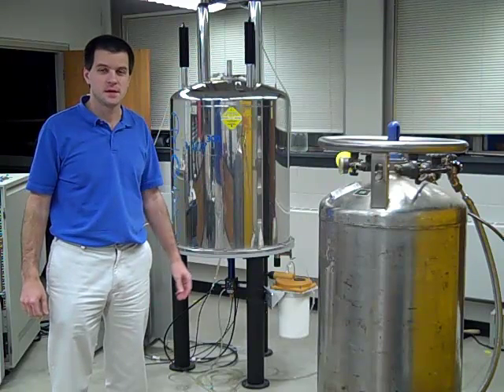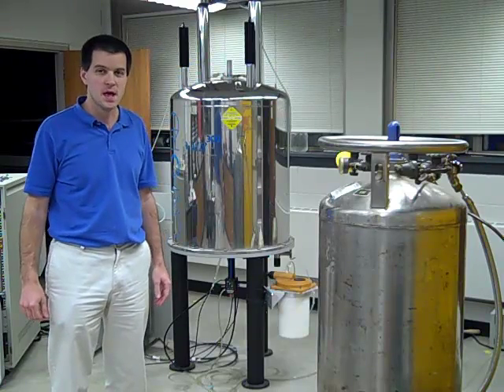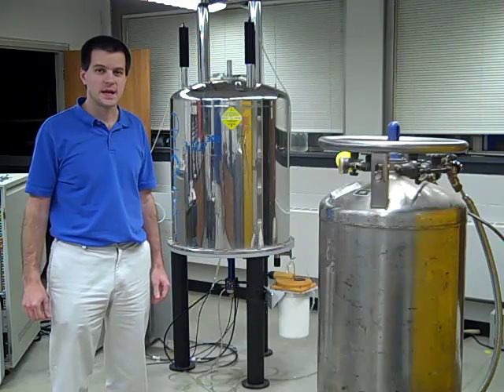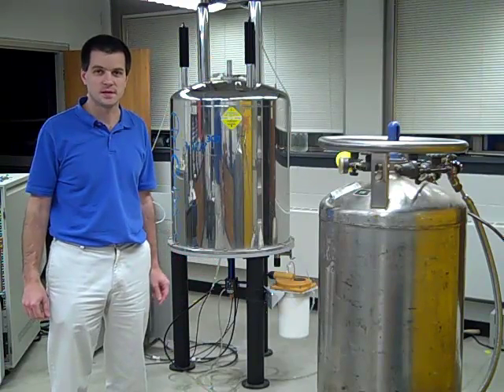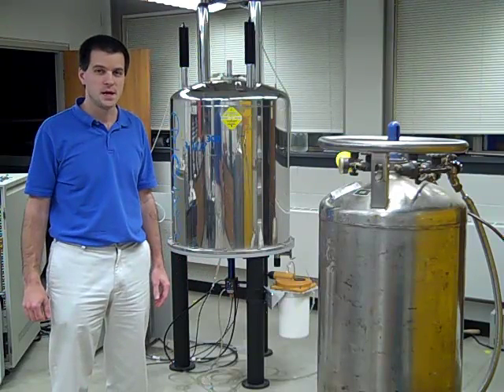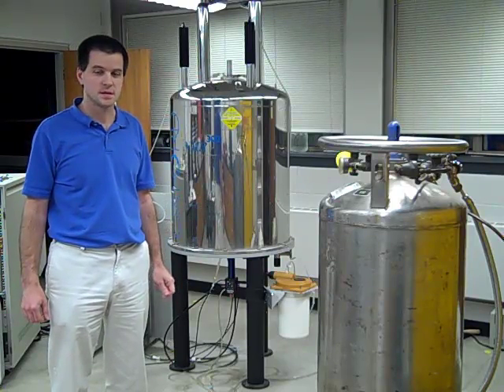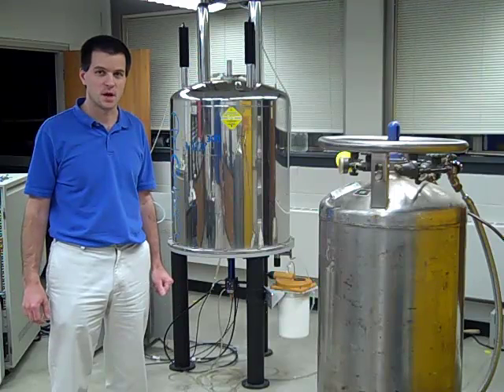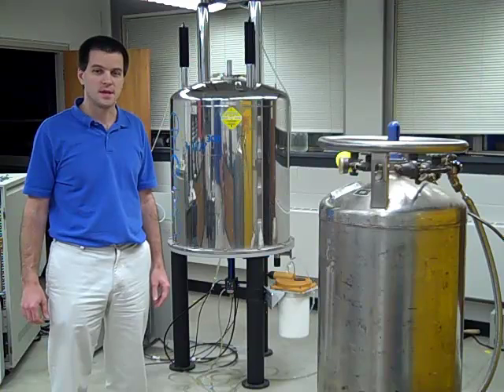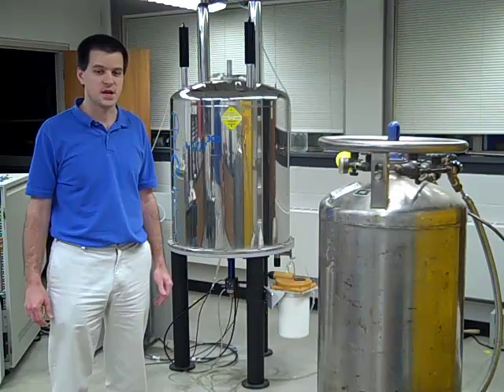This instrument here is our NMR, or Nuclear Magnetic Resonance Spectrometer. This instrument is primarily used for characterization of organic compounds and is a key component of coursework in organic chemistry here in particular. This particular instrument actually will be replaced in the spring of 2012 with a new 400 megahertz instrument that will be funded as part of a grant, again, from the National Science Foundation.